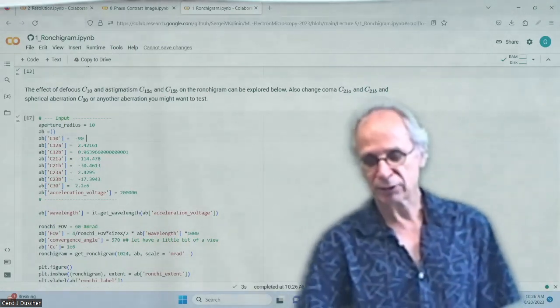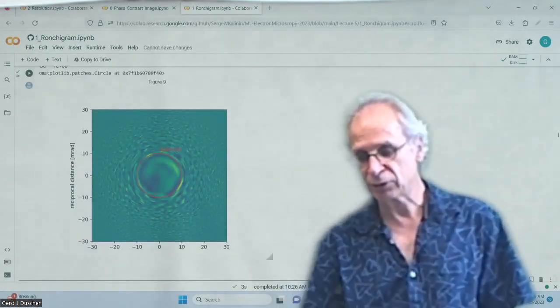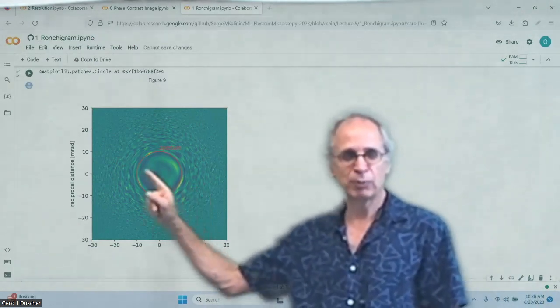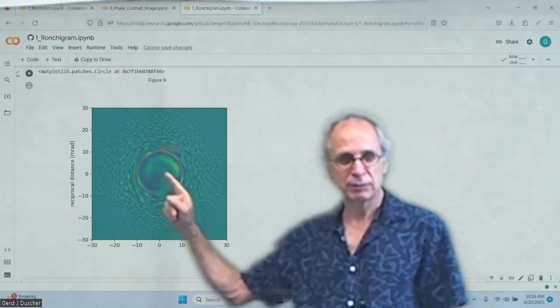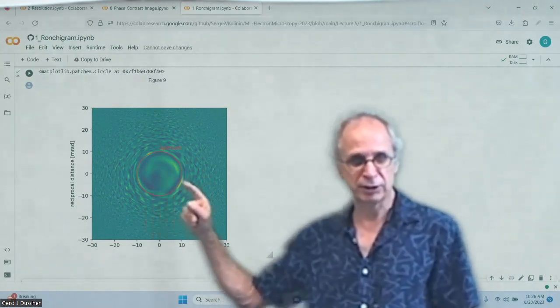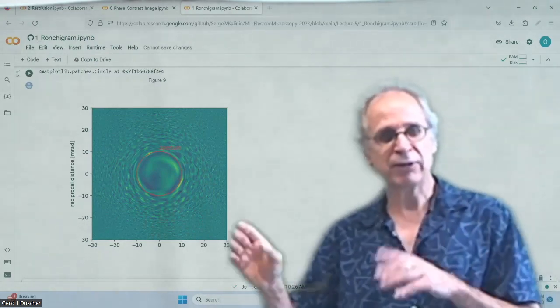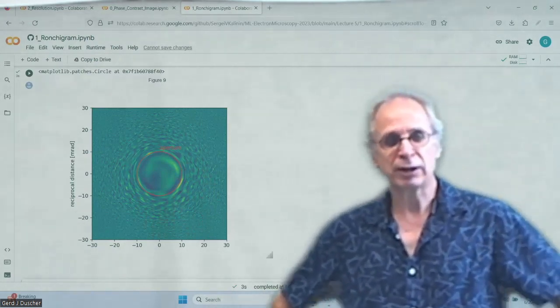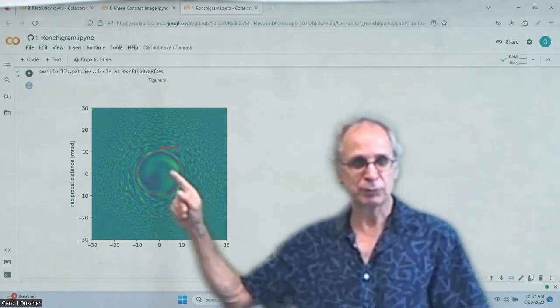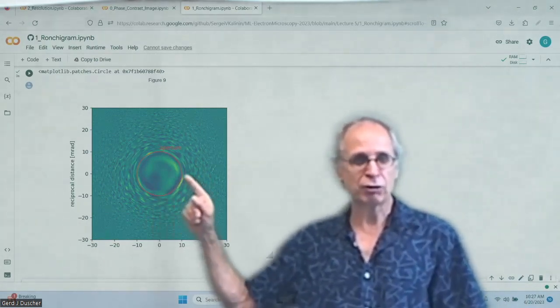Which for our microscope is about the Scherzer focus. We see we get something very, very blobby, and we must be on something with a higher thickness and lower thickness on here. So it depends a little bit on which kind of random distribution you have. Okay, so this will be a Ronchigram focus.